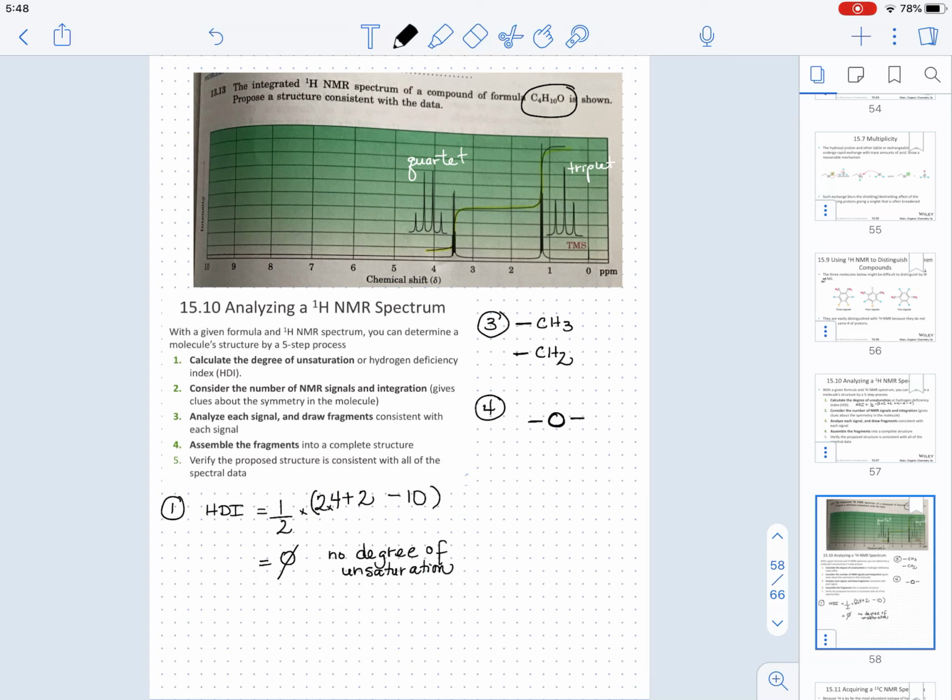Now, if we have a CH2 followed by a CH3, that takes into account 2 carbons, 5 hydrogens, and the oxygen atom. Now, if to the other side of the molecule we draw a CH2 and a CH3, then not only does representing this ether make sense, but at the level of the structure, in a way, this can be rationalized.